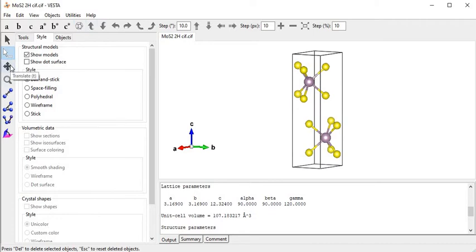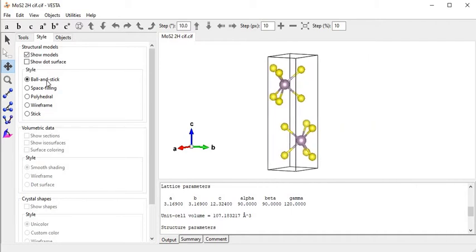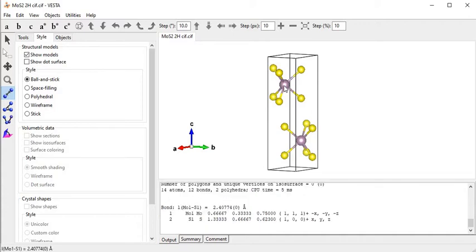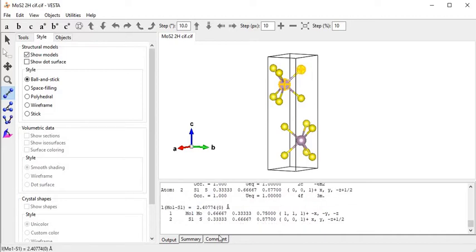This is the translator again - after clicking that part we can move this crystal along any direction as required. This is the magnifier. This next part is very important: we can measure the bond length between two atoms. I click on that part, then click on the molybdenum atom and another atom. The distance between this molybdenum and the upper atom is around 2.4 angstroms.